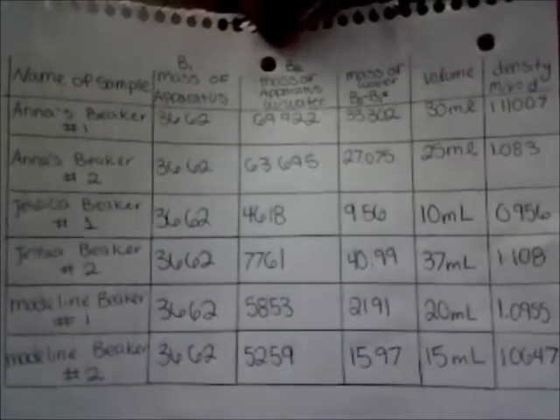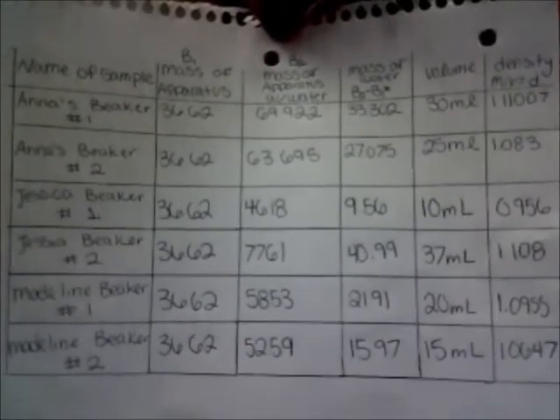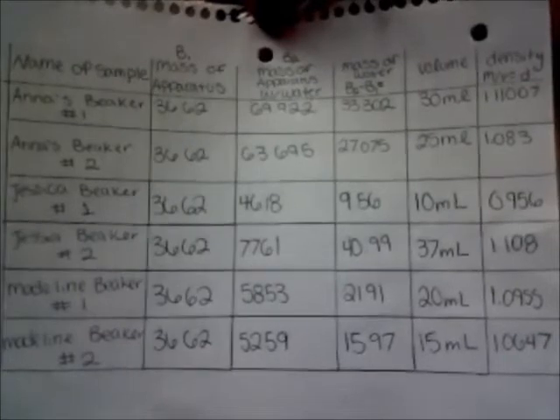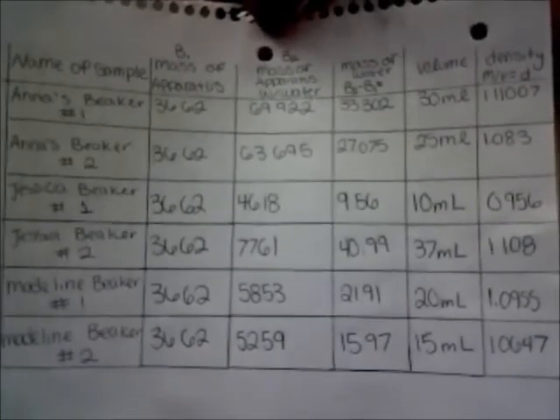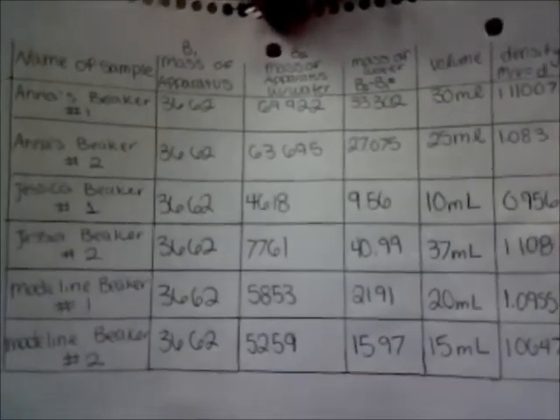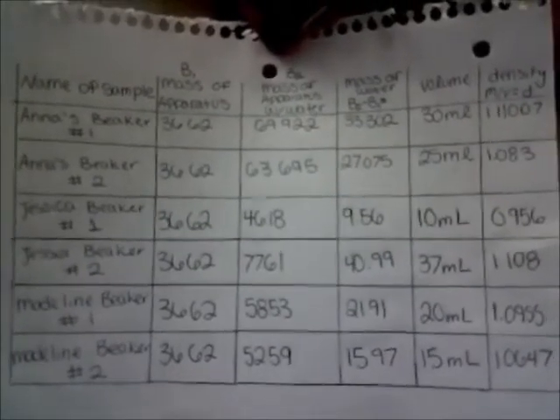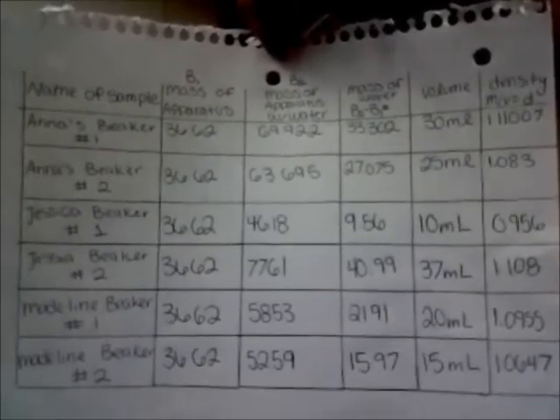Here is our data table for the beaker measurements. The column labeled mass of the apparatus represents the mass of the empty beaker. The second column has the measurements for the mass of the beaker and the solution. The next column shows the mass of the solution, while the fourth column is the volume of the solution placed in the beaker. The last column represents the density of the solution, which is mass divided by volume.